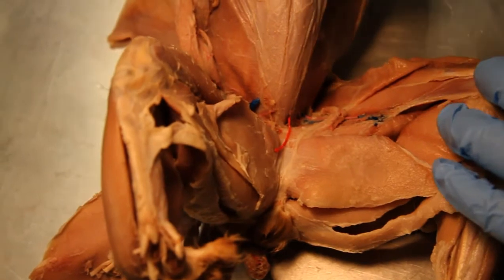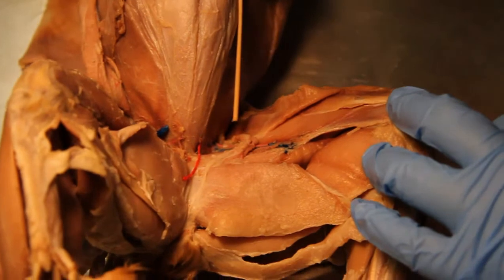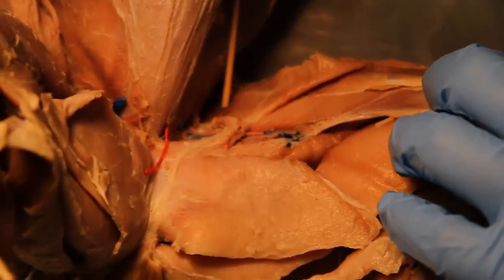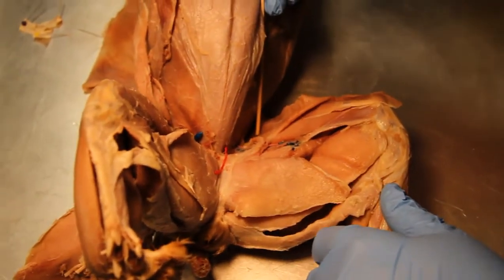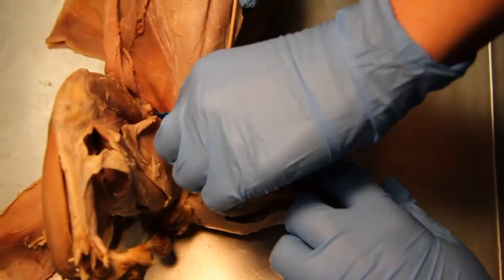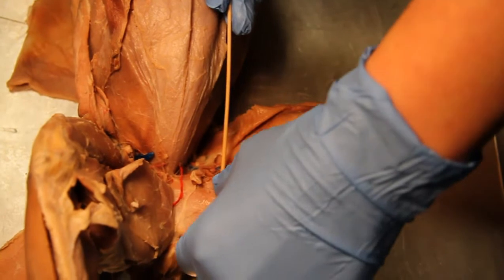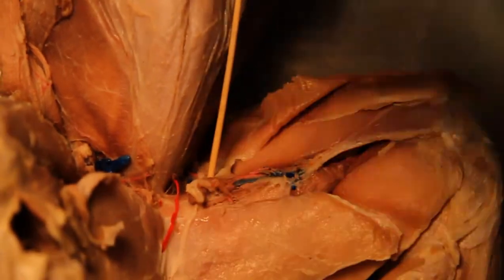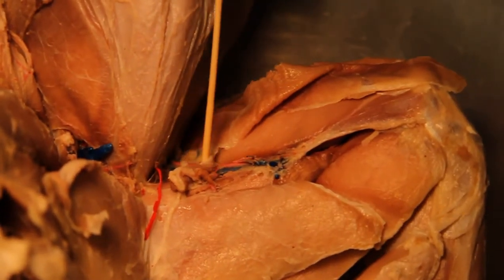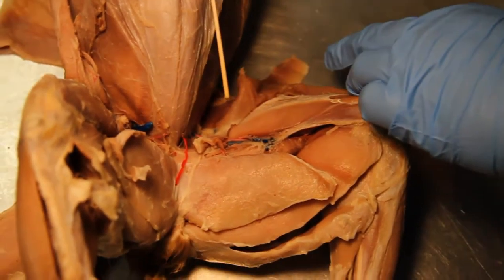This is the sartorius. And so would the pectineus be up here? Where's the adductor longus? The pectineus is right there — so the pectineus must be right up there, because that's the longus. This is the longus right here, so the pectineus might be right up here somewhere. That's the sartorius — you can barely even see that on here.